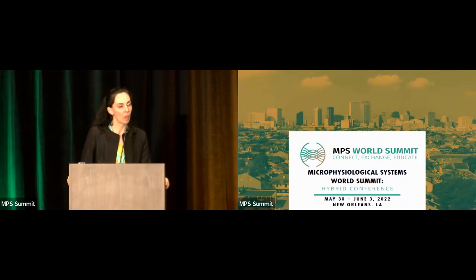All right, one last question, Wesley. In the clinic, there's a lot of work trying to regrow cartilage, especially. Can your chip model this at all? Growing cartilage? Yeah, regrowing or something like that. So what we do is use already differentiated cells. We use chondrocytes to start with, so we do not differentiate mesenchymal stromal cells into the chondrogenic lineage. But the cells do behave quite well depending on the matrix that you put them in as well.